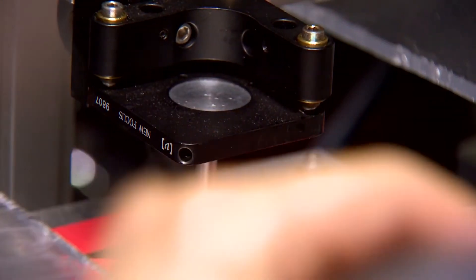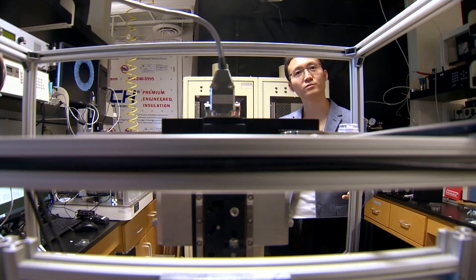This lab is where something gets created out of nothing. We developed a new 3D printing system.